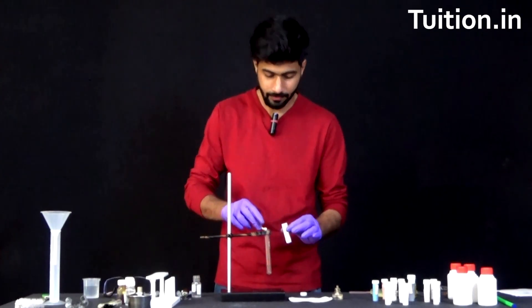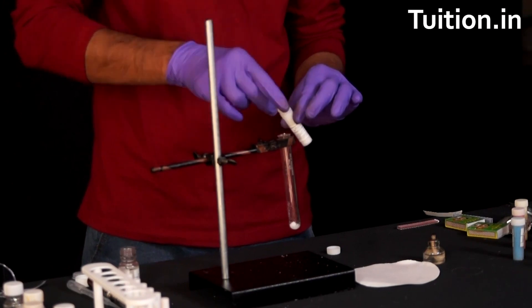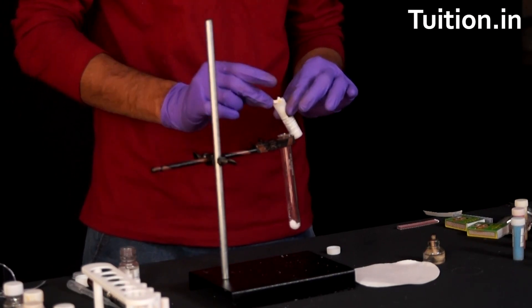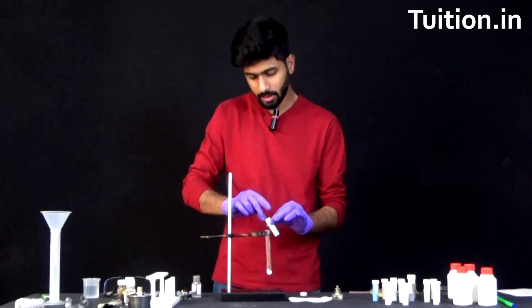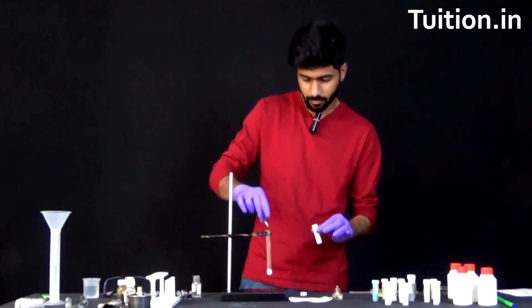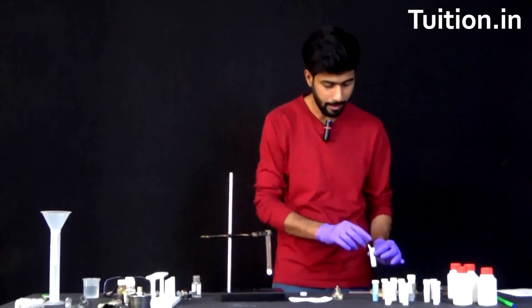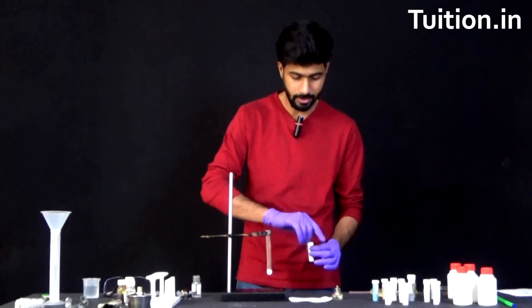Let's start doing that. I think this should be enough — roughly about 5 grams of ammonium chloride taken. Let's put it back to place.